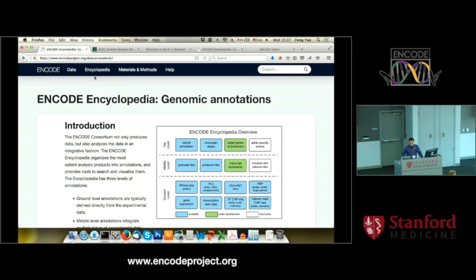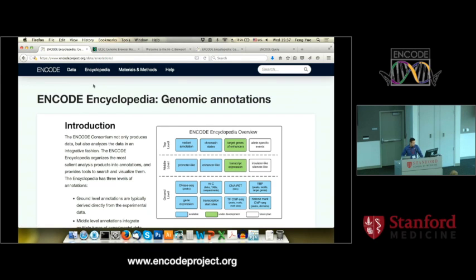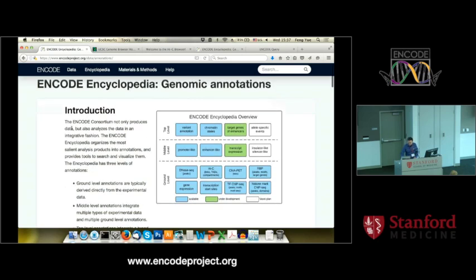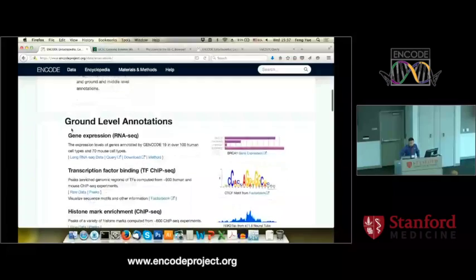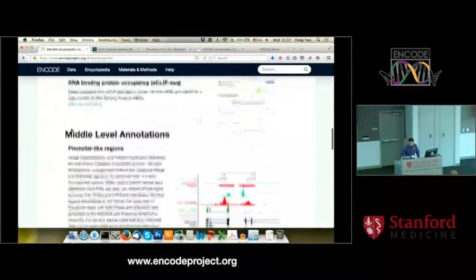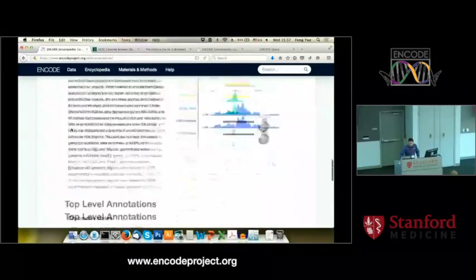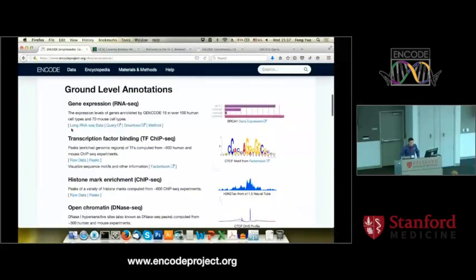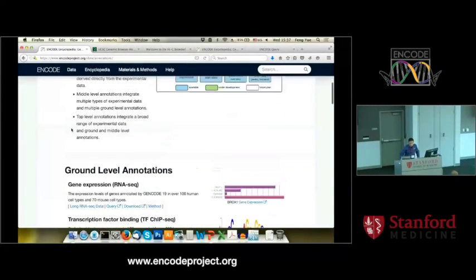If you go to Encyclopedia and click Encyclopedia, then click About — in this page, just as you've been introduced, there are some ground-level annotations, mid-level annotations, and high-level annotations. What I want to show you first is gene expression.